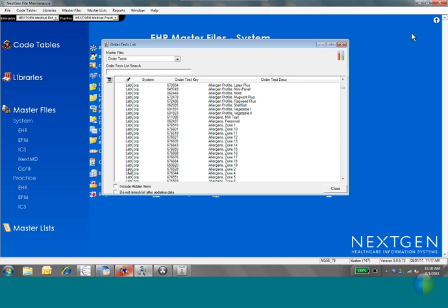And more or less, the spreadsheet they give you usually has your most commonly ordered test first, and it kind of goes in order of importance down from there. But they may still give it to you alphabetically, things like that. But the bottom line is you need a spreadsheet from the vendor that contains all of the tests that you are going to need to order.